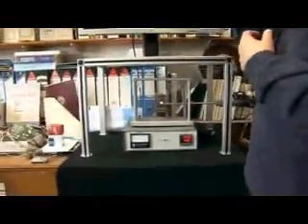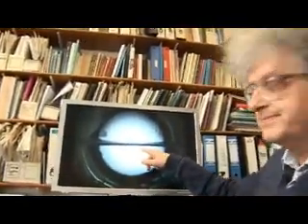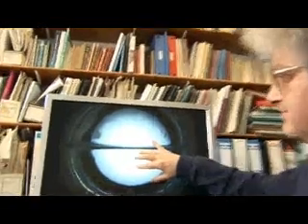So if we start heating this — I just flicked this switch and switched on the heater — so the temperature you can see is going up, and as the temperature goes up this begins to boil. You can see it begins to boil.